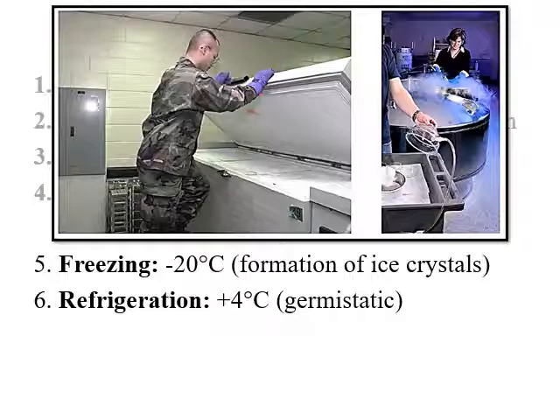The reason why a chest freezer is actually more efficient is because cold air is more dense than warm air. If you have cold air in a vertical refrigerator and you open up the door, the cold air falls out because it's heavier, it's denser than the warm air. As soon as you open the door to your refrigerator, the cold air will spill out onto the floor. Warm air will replace it, and then you have to shut the door and let the refrigerator cool down again. But if you have a chest freezer like this, you open the lid at the top and the cold air stays in the bottom. So this is actually much more efficient.